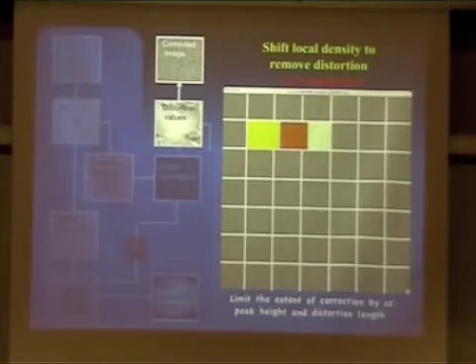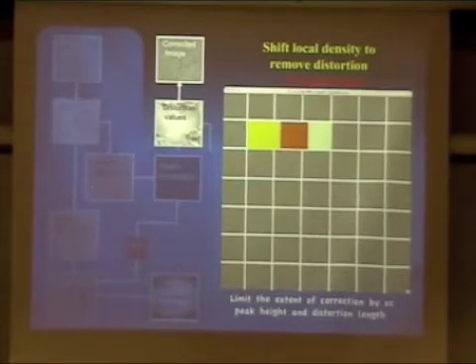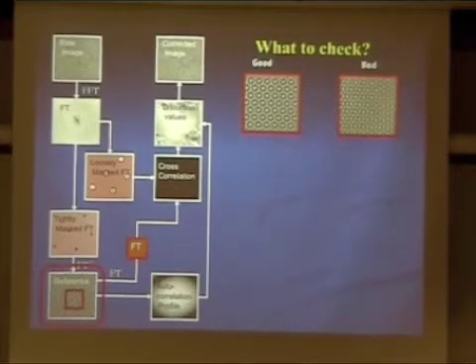All you are trying to do with extra rounds is to get a better estimate of what the distortion is. Okay. So this is the main point about whether you can check if something doesn't come out as well as you would like. The first is the reference. If your reference area is supposed to look like this, and it ends up looking like that, it's not good.